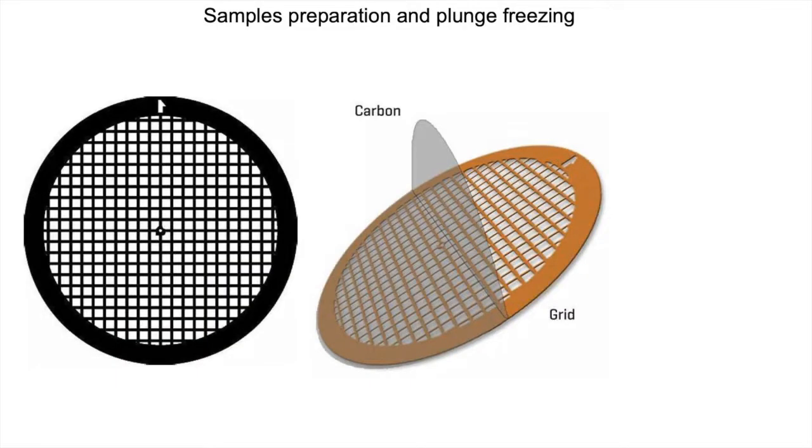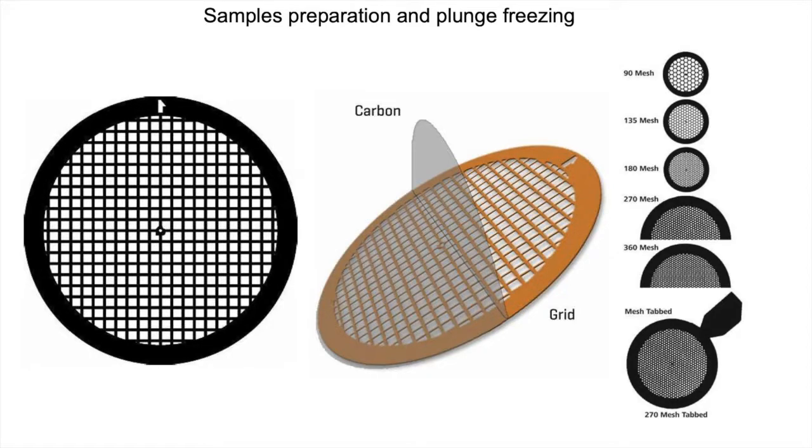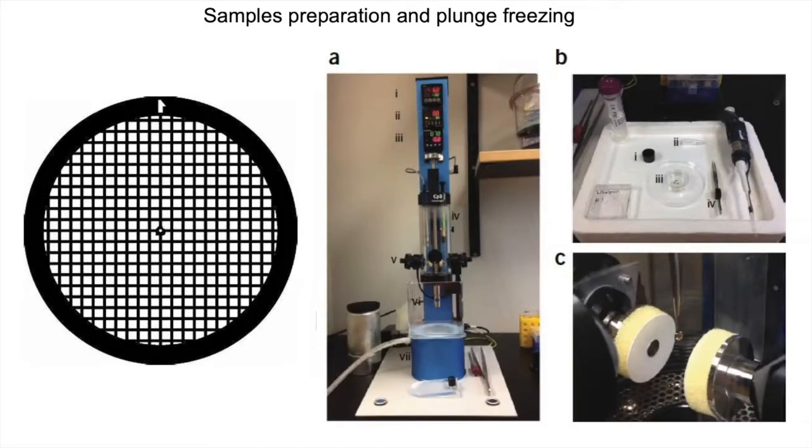Okay, so a cryo-EM grid, as some of y'all might already know, looks something like this. There are various different sizes, different shapes, and they come in different dimensions. Normally for cells, what Liz's lab found was that the gold grids are pretty inert, and they are useful to grow cells on. You have to take your grid, prepare your grid with cells or viruses, then put them in one of these cryo plunger systems. In our lab, we use the CP3, and you set your grid holder right over there, and there's liquid ethane. You blot your sample, remove all the excess water from your sample, and then you plunge it to get nice ice on your sample.